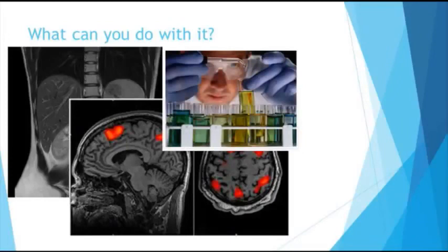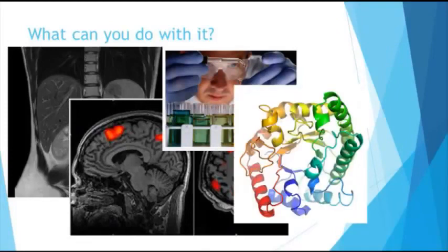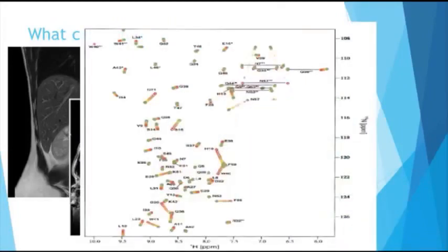It's also used for samples. I'll talk more about this with the mass spec section, but you can take a sample and very accurately work out what's inside there, even down to atom level. It's very useful for protein structure. So proteins that you can't get the structure of by other ways, you can use NMR to work out what atoms are nearby and start building up the structure of the protein. What I used it for was to take a sample, do an NMR of your sample, then add something and do it again and see what changed.